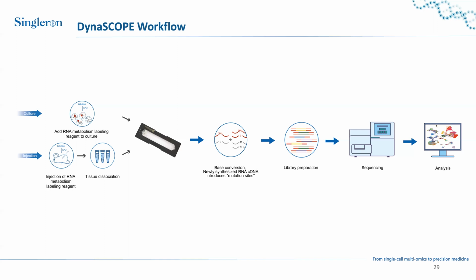And the duration of the treatment? We recommend treatment with 2 to 4 hours. It completely depends on your target.